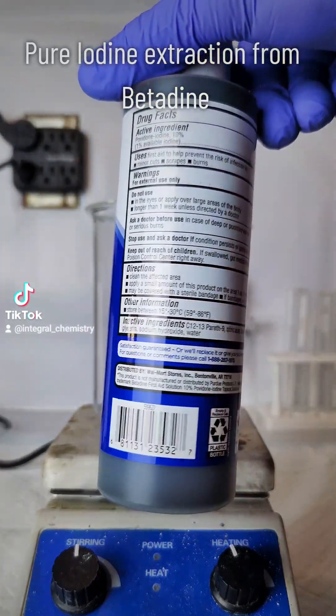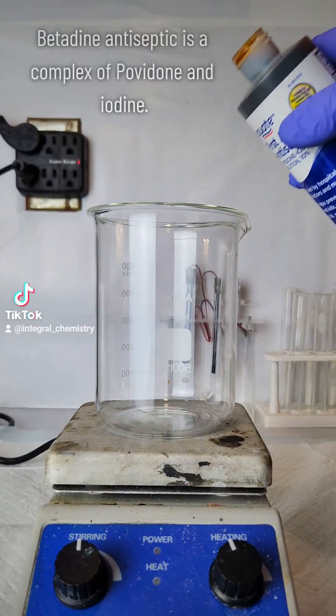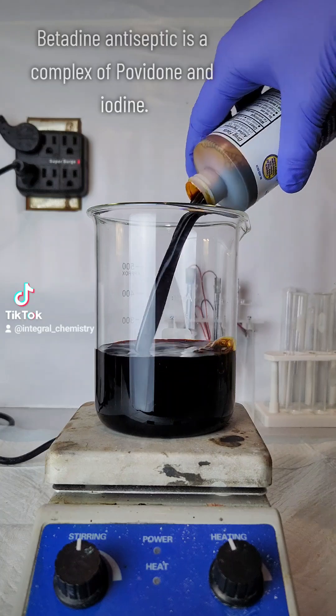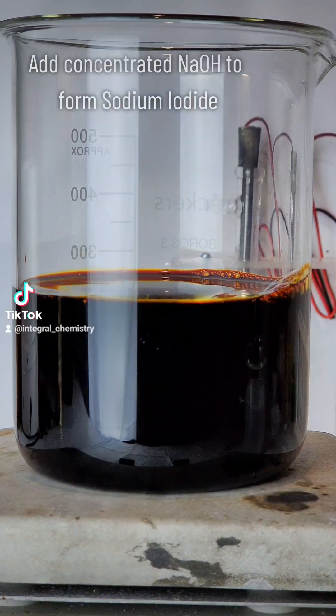Today I'm going to extract pure elemental iodine from a betadine antiseptic solution. Betadine is a complex between iodine and povidone, or PVP, and you can pick it up at pretty much any pharmacy or Walmart.